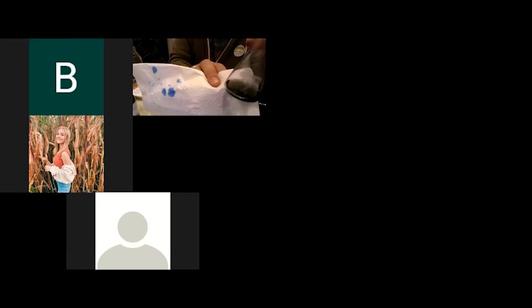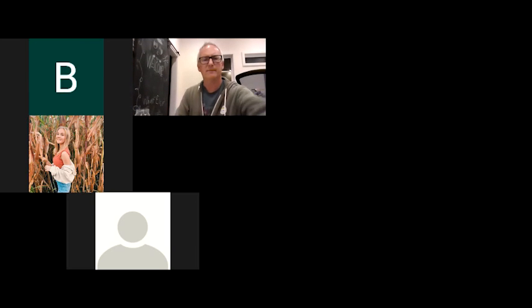You get a bright yellow and then it turns blue, and then you mix it up and you get this sort of aqua, blue-green color, sort of this dark teal color. And that's the color you're looking for. So I think the problem was, yeah, I went over. I used more than half a gram.